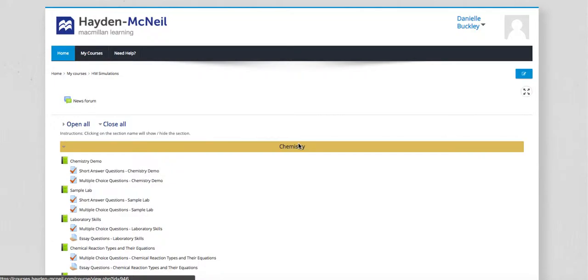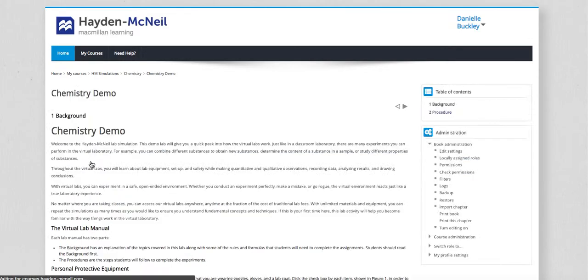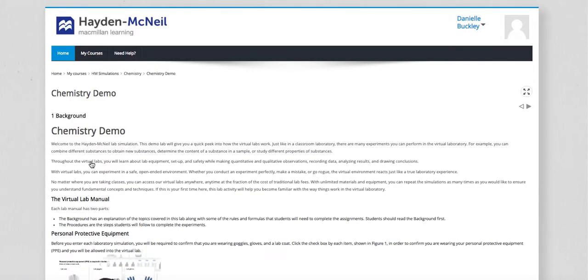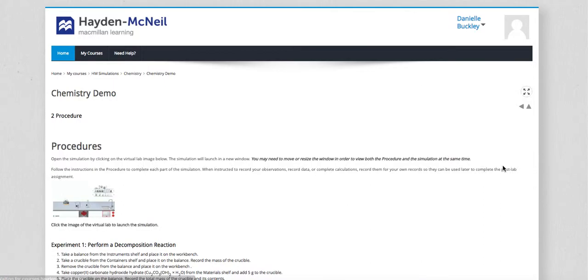The new Hayden McNeil lab simulation experience begins on the course home page. Students will click the lab manual to access the background information. When they've finished reviewing this information, they can move on to the procedure.